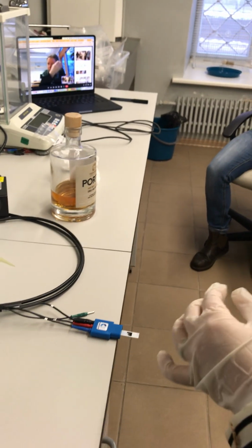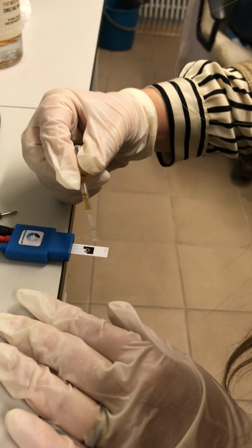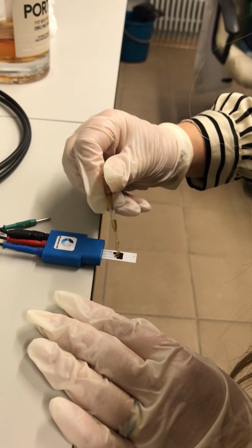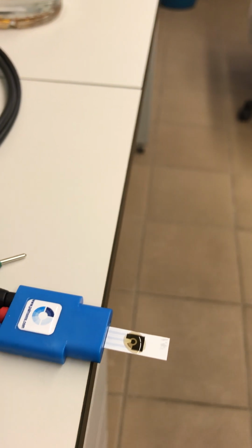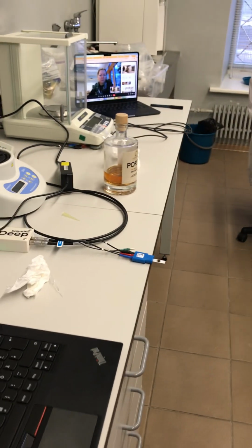All this is electrochemistry, the branch of physical chemistry concerned with the relationship between electrical potential difference and identifiable chemical change. Also, it has some color, so we might use that. This is the oldest whiskey sample. Nice.